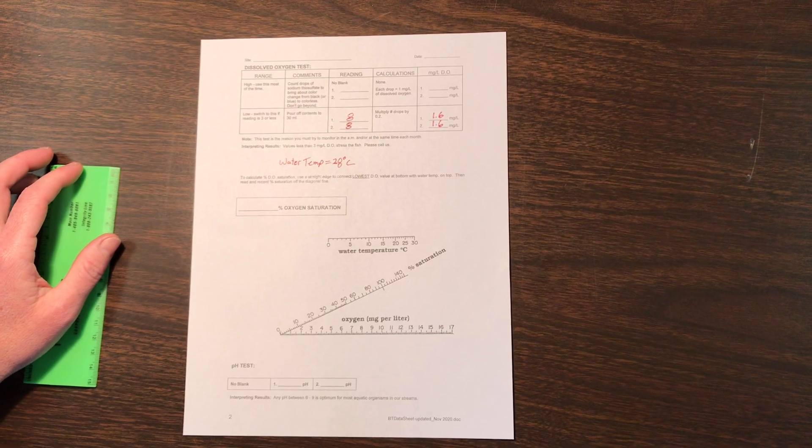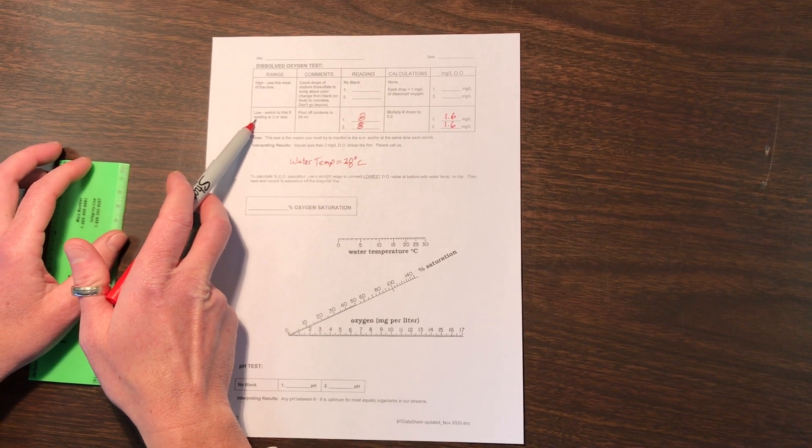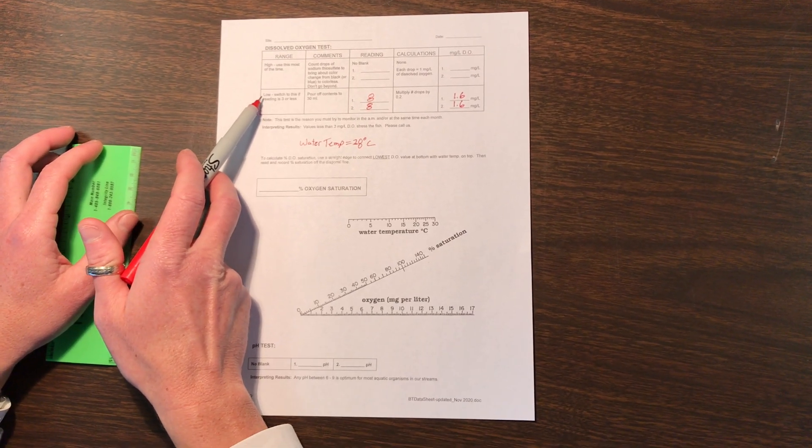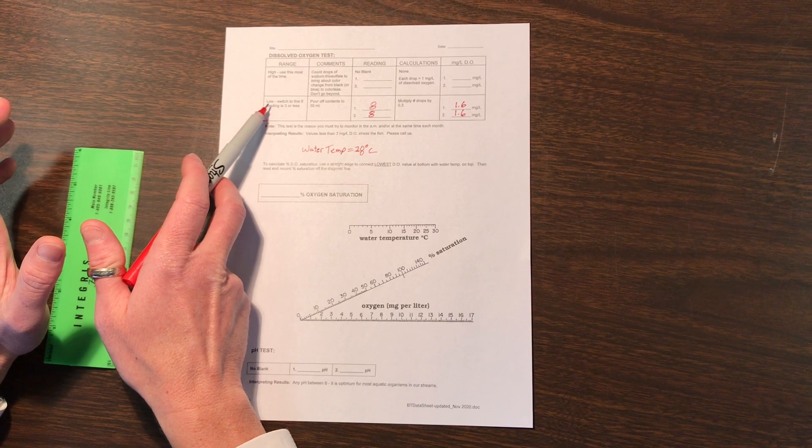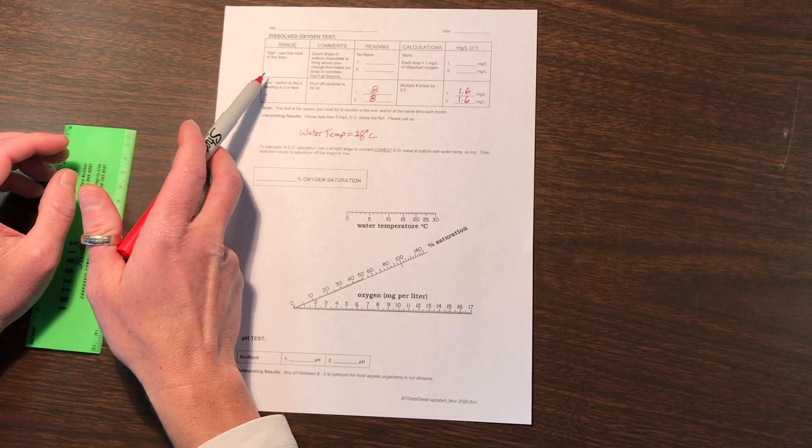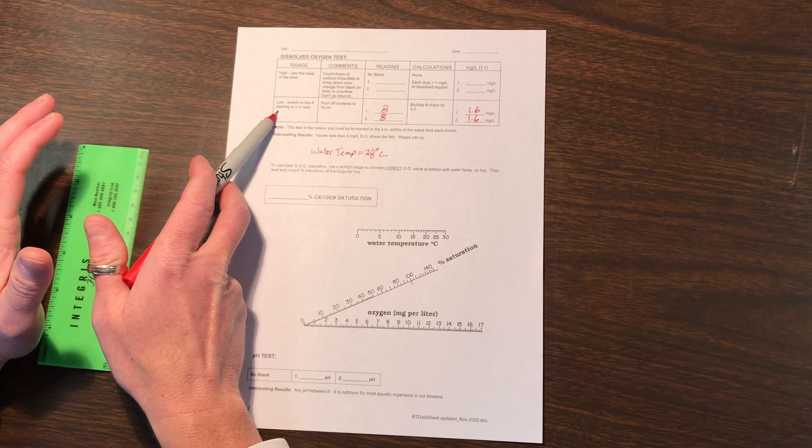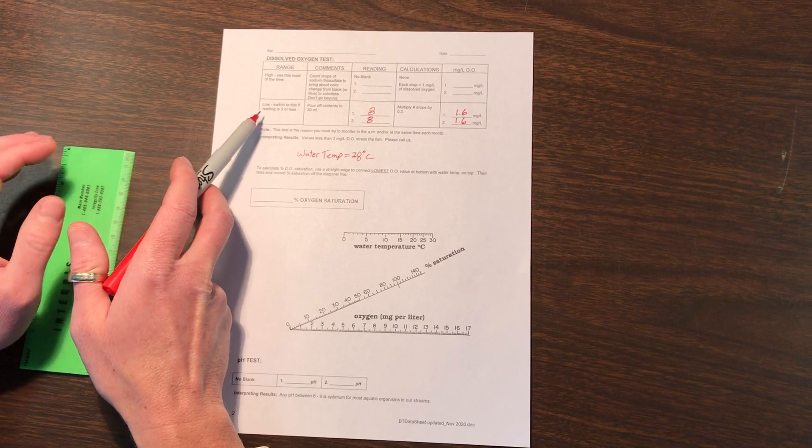This is a second scenario. If you are having to do the low range test of oxygen, that means if your dissolved oxygen bottles change within the first 3 drops of the sodium thiosulfate, then you will need to switch and do the low range test. Read through the instructions on that and or watch the video.